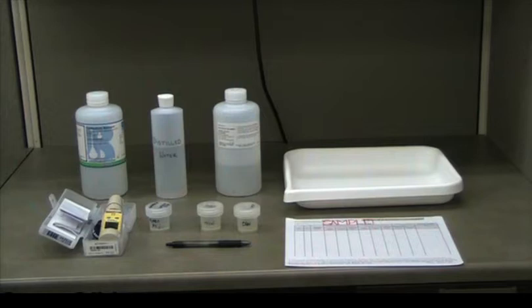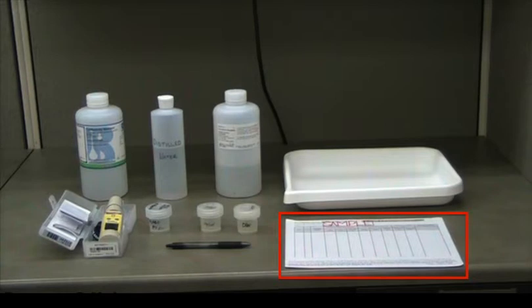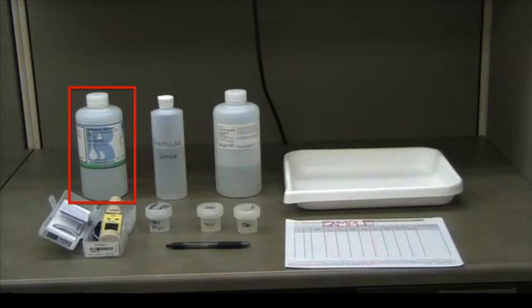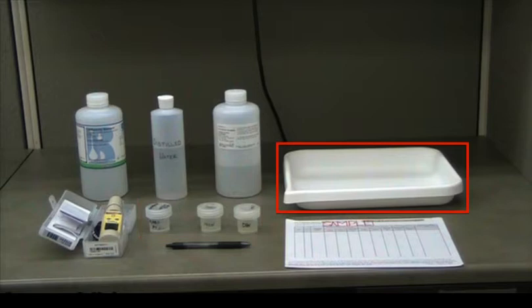To calibrate the meter you will need: EC tester specific conductance meter, EC tester two-point calibration log, distilled water, 10,000 microsiemens per centimeter solution, 1,413 microsiemens per centimeter solution, three 30-milliliter Nalgene jars, a waste tray, and a pen or pencil.